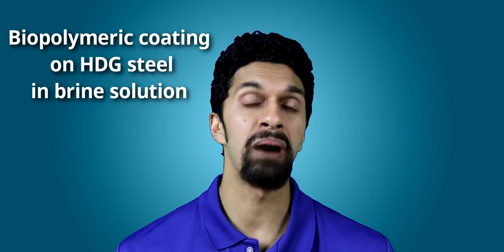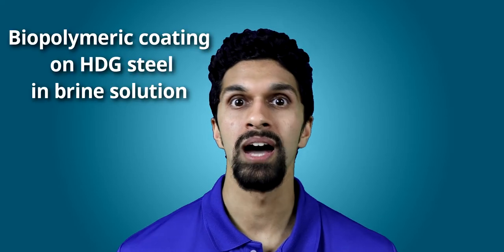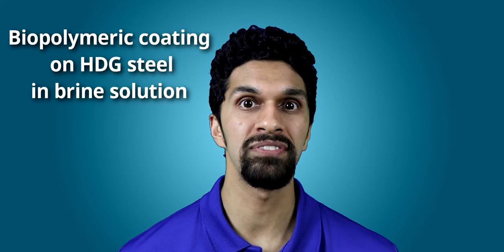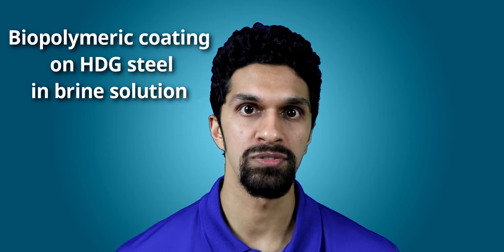Hey folks, in this video we're going to be talking about electrochemical impedance spectroscopy of steel corrosion. Specifically, we're going to be looking at EIS circuit fitting of a biopolymer coating on hot dipped galvanized steel in brine solution.